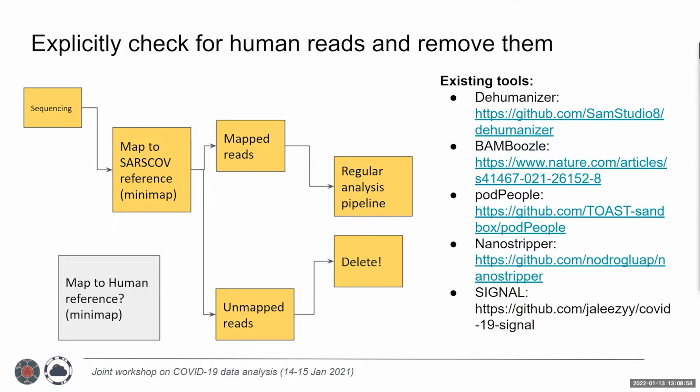You need to remove these reads before you deposit them in most public archives to protect the host, particularly since many of the samples may have different levels of consent attached to them. So even though with Arctic you're using a targeted sequencing approach, some host does sneak through every now and again, so it's best to double check.